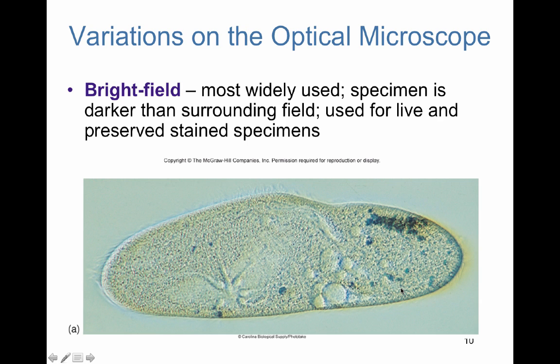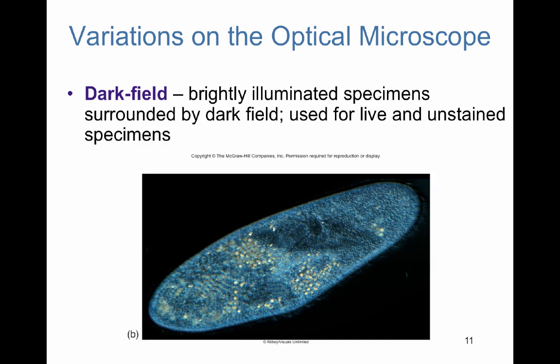So what you're seeing here is actually a paramecium. It's a type of protozoan. But bright field allows us to visualize most microbes.